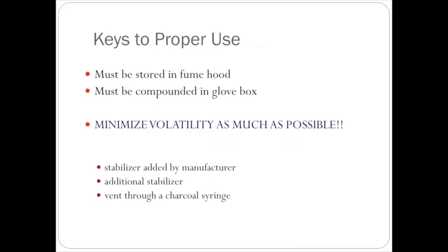But also because the fume hood, as I mentioned, we have filters in there that trap the radioactivity. It's a little more challenging to change the filters in a fume hood than it is to change them in a glove box. So we do most of our manipulations, compounding, potential spilling in the glove box. If we do spill, we have charcoal filters that we can use to help trap that radioactive iodine, but it's very easy to change those out and clean up the mess once it's done.